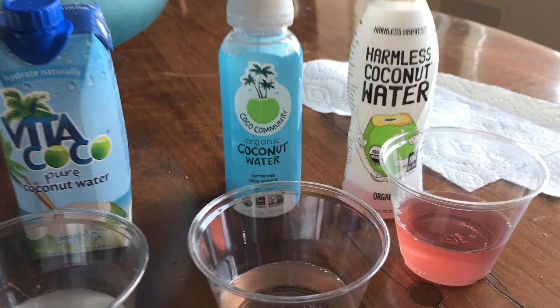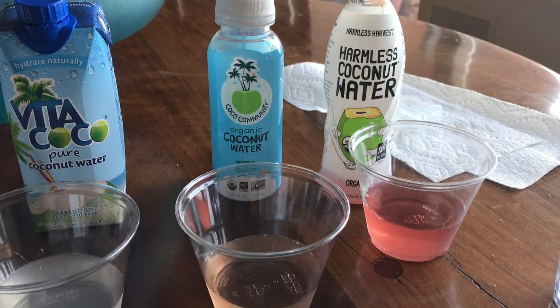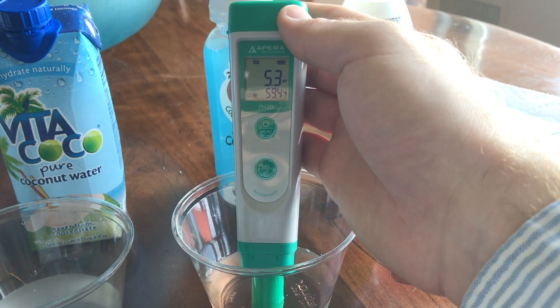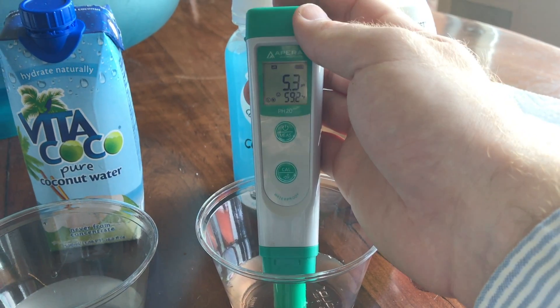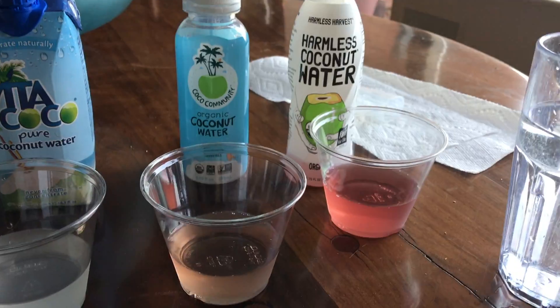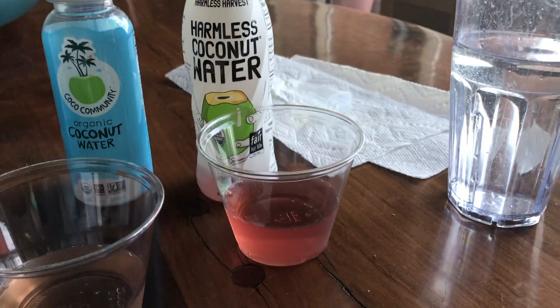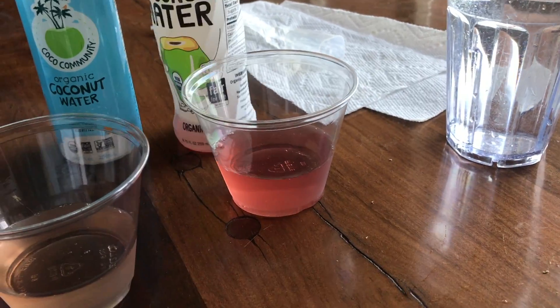Coco Community. This one's a little bit more expensive and has a different color due to the antioxidants within the water. Let's test the pH. 5.3 — so slightly more acidic, but I'm going to say that's a pretty good coconut water, much better than a few that we've tested. Now I'm just going to recalibrate it again and move on to our last one.